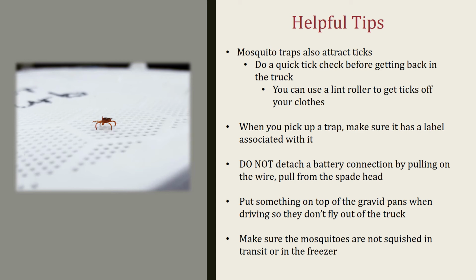When you pick up a trap, make sure it has a label associated with it. This is very important, because if you come back and you have multiple of the same traps without a label, it might be hard to figure out exactly where it came from. Do not detach a battery connection by pulling on the wire. Always pull from the spade head. If you pull from the wire, you might end up breaking the trap.